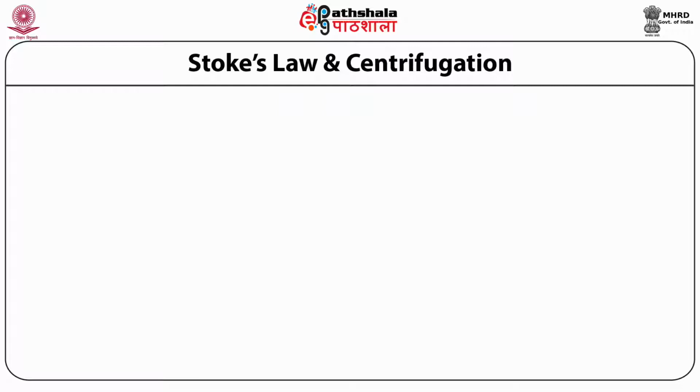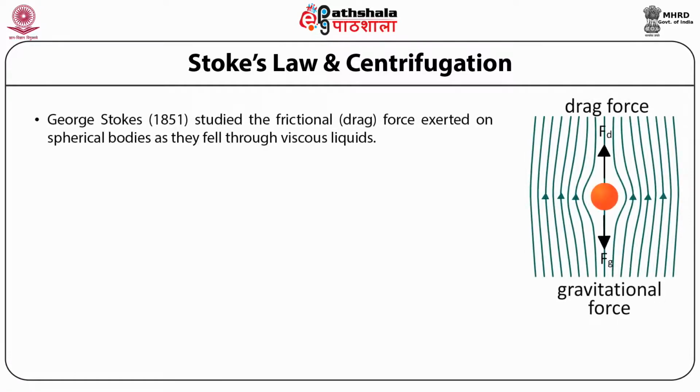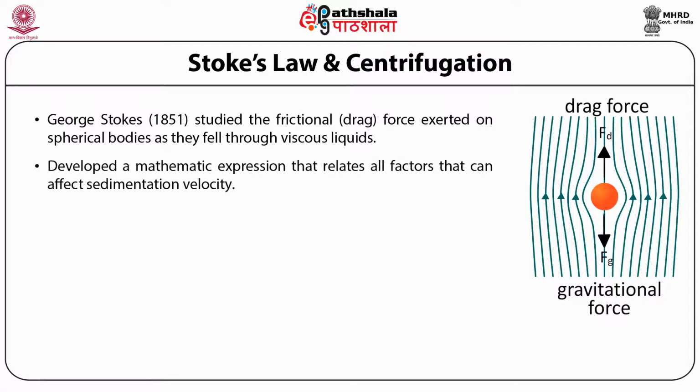We will give you the idea of how the Stokes equation is applied to centrifugation, especially in the case of differential centrifugation. In earlier centrifugation, usually the liquid medium is water, but here we have to add certain high density medium which can separate the molecules, and therefore the viscosity of the medium is a very essential factor.